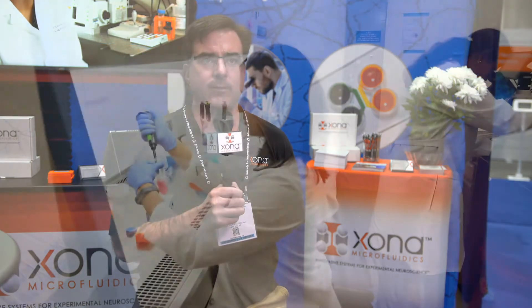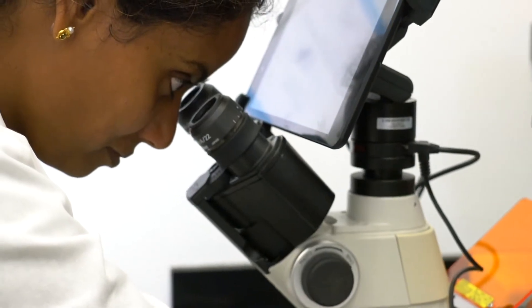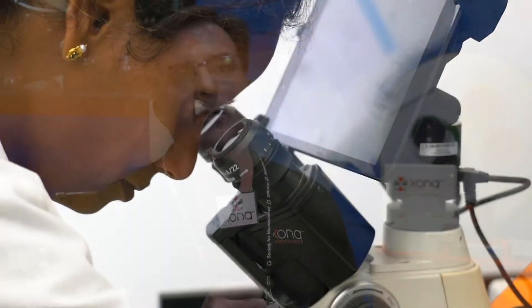For the last 10 years, Xona has been bringing technology to neuroscientists that allows them to isolate axons from the neuronal cell bodies. Previous versions of our product were made out of silicone and required customers to bond the silicone device to cover glass.